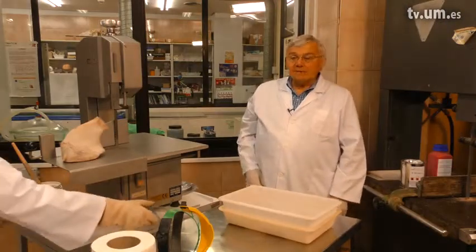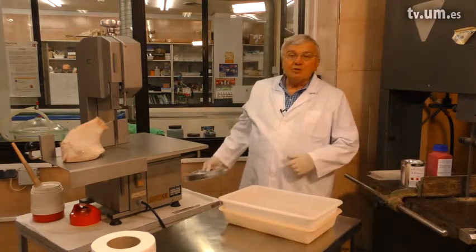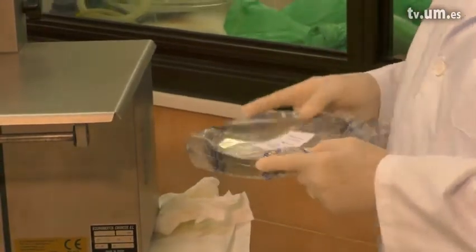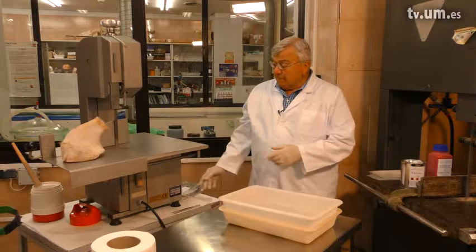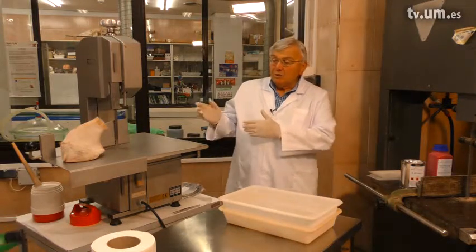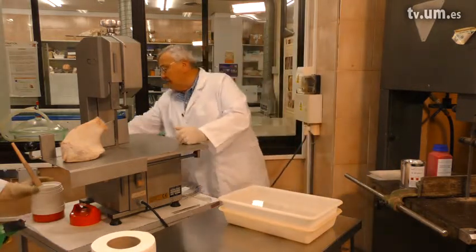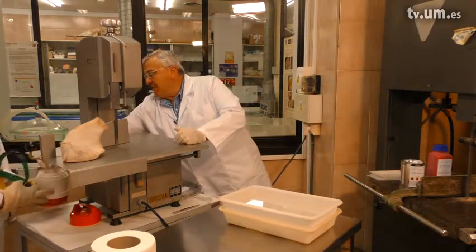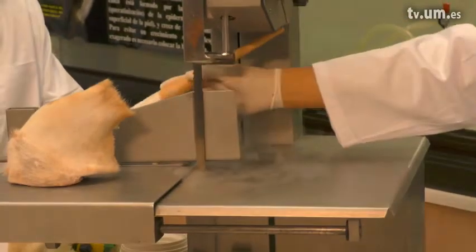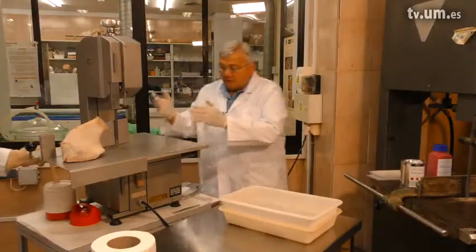For slicing specimens, we use a regular bandsaw. Before each use, we want to use a new blade to make sure it's very sharp. Once the blade has been changed, we're going to cool the guide stop with liquid nitrogen — painting it on the guide stop to cool it. Once it's cooled, then we can start the slicing.